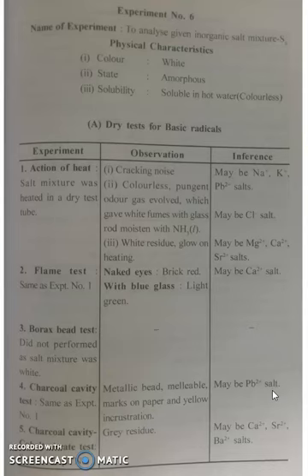You have to perform next the wet test for acid radicals. What does it mean, wet test for acid radicals? You have to perform again one experiment: to a hot solution of salt mixture in dilute hydrochloric acid, barium chloride solution was added.